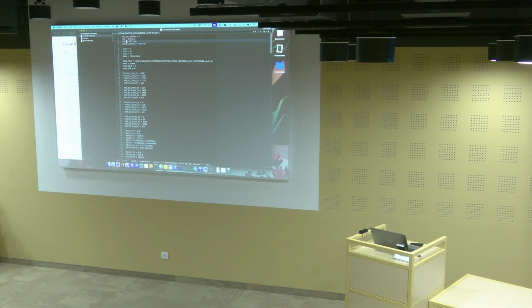Then you have this CLEN, that's the camera length, the distance between the crystal and the detector, which is something that we very often need to optimize during an experiment, and also afterwards if we do the offline data processing. And so we basically do that by changing this value and then reprocess the data until we find the best value. So what do we call the best value?